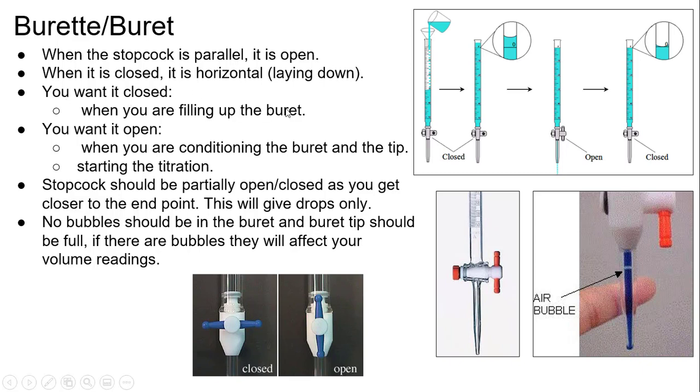Well, you want it closed when you are filling the burette because all of this will spill out all over the place. And you want it open when you are starting your titration or you are cleaning and prepping the burette. Why do you want it open when you're cleaning and still pouring solutions in? Because you want to rinse those out.